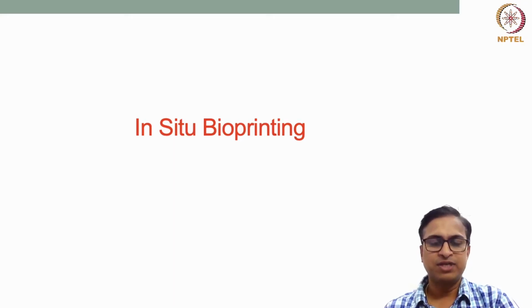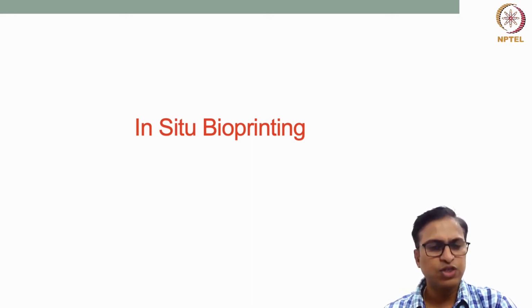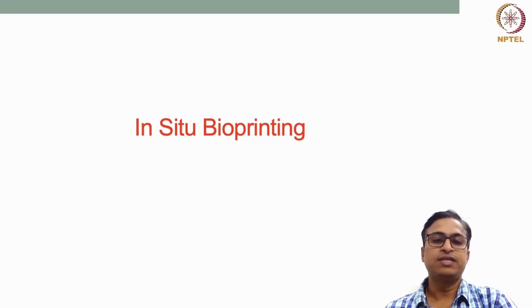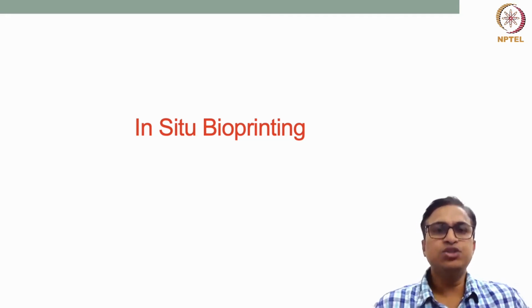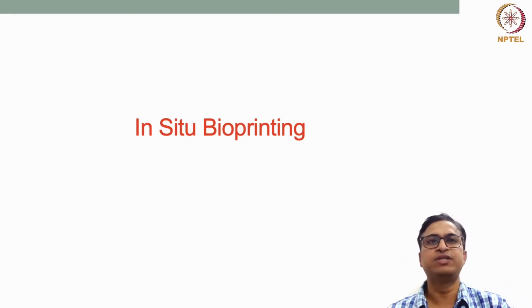Welcome back to the organ printing course. So in this lecture, we'll discuss a very important bioprinting concept that has been developed recently in the last few years. It is in situ bioprinting. Here, in situ means on the bed, on the patient. So this bioprinting deals with directly printing cells plus materials on the patient's wound bed directly.